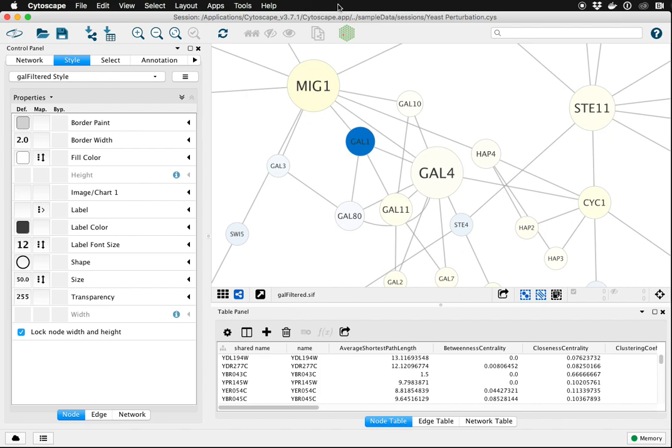For example, in this network we have our data mapped to node fill color and our labels in the center. Everything looks pretty good except for situations like this, Gal1, where the label is difficult to read because of the dark background.